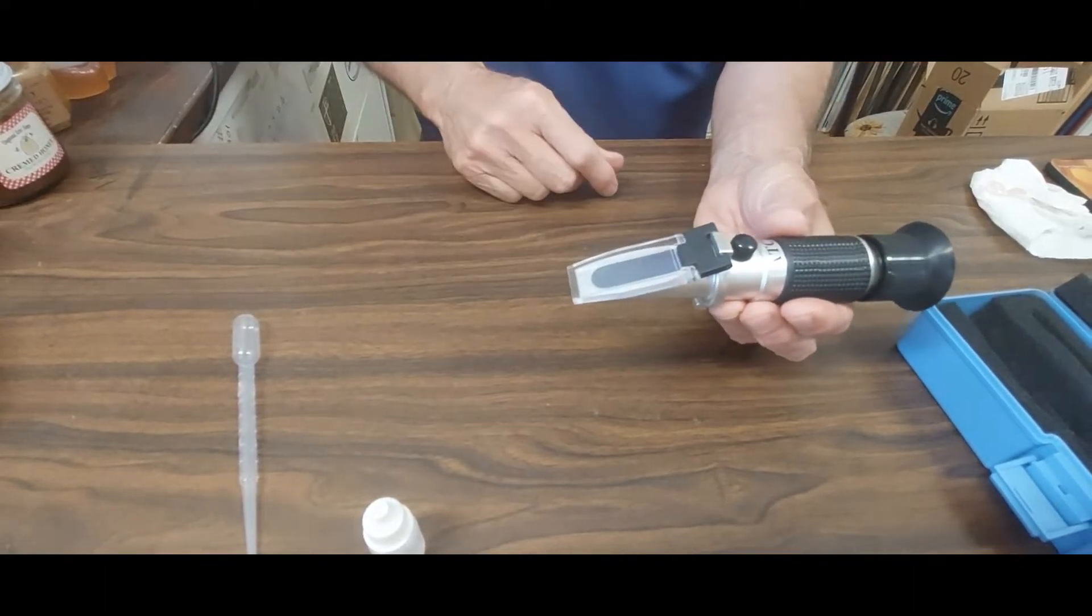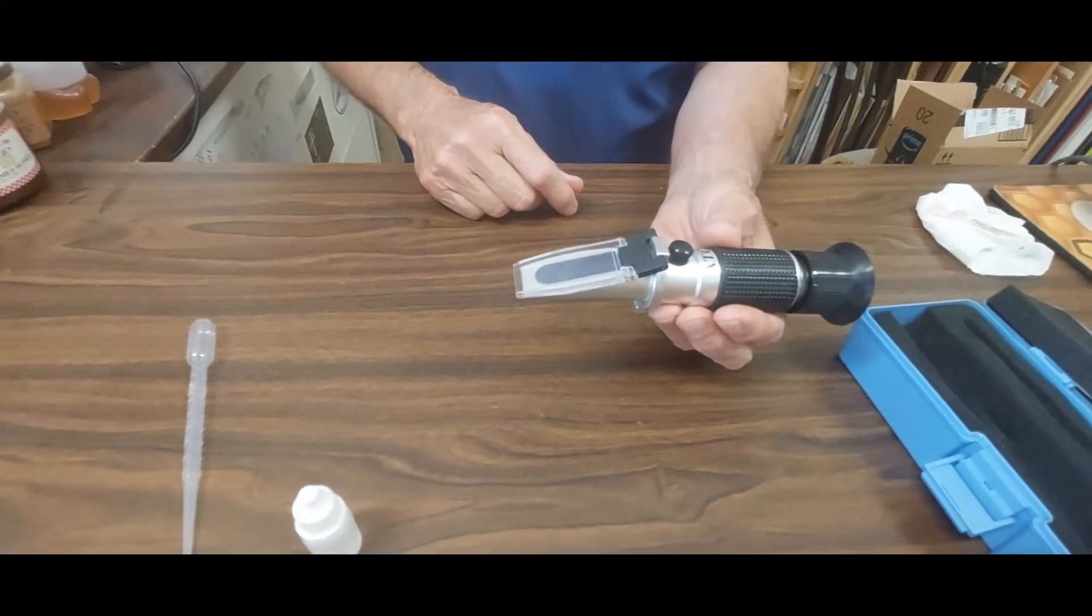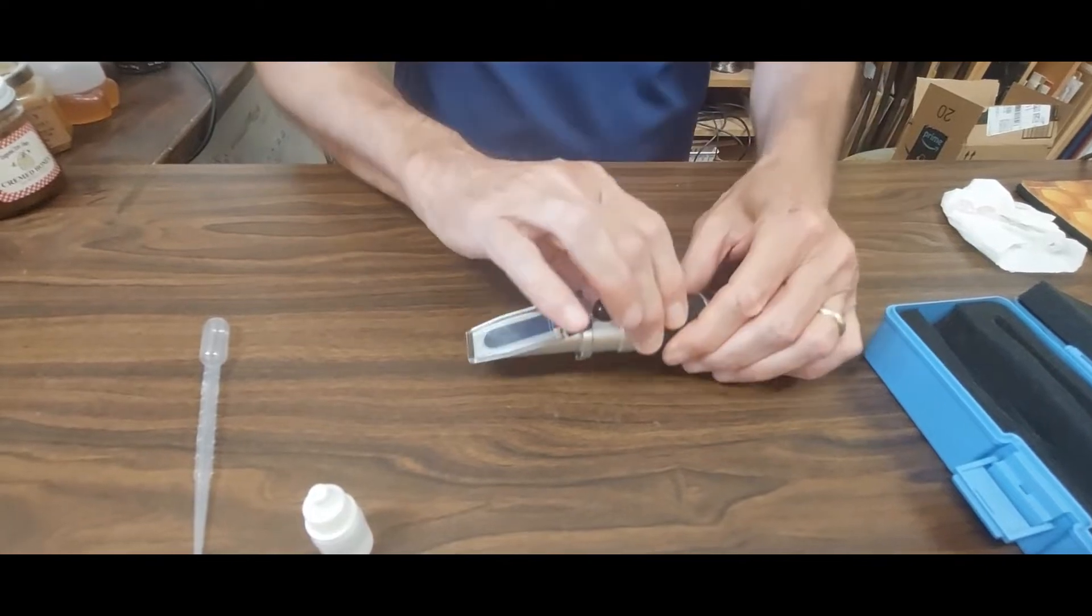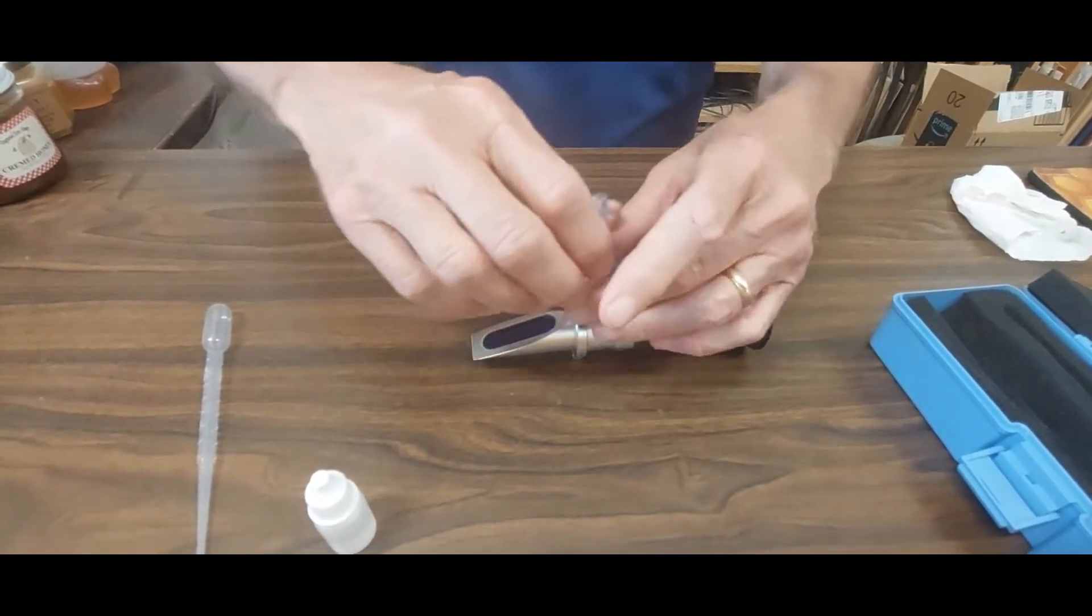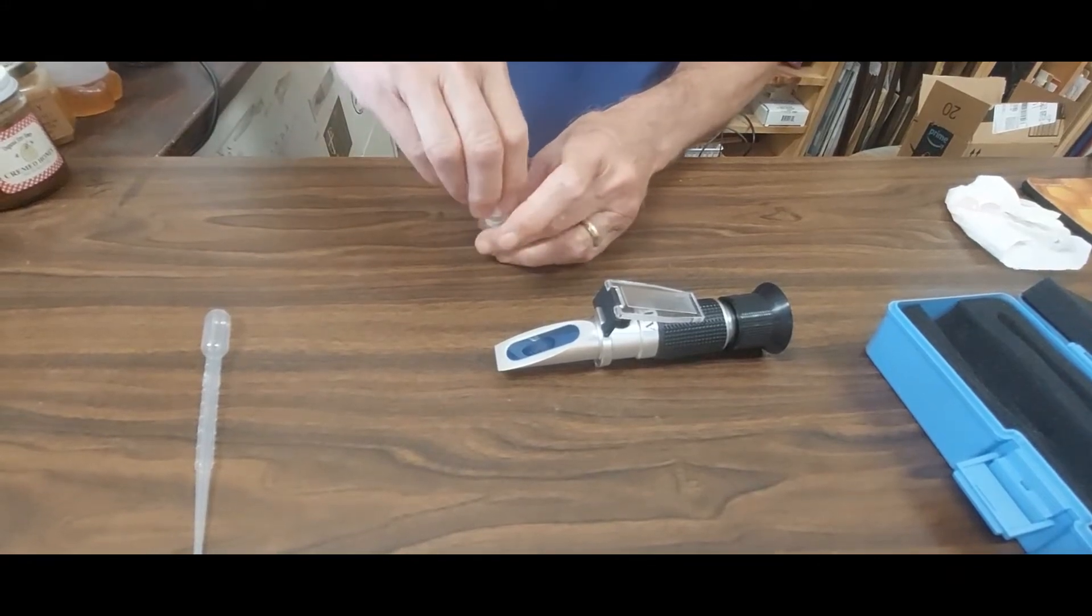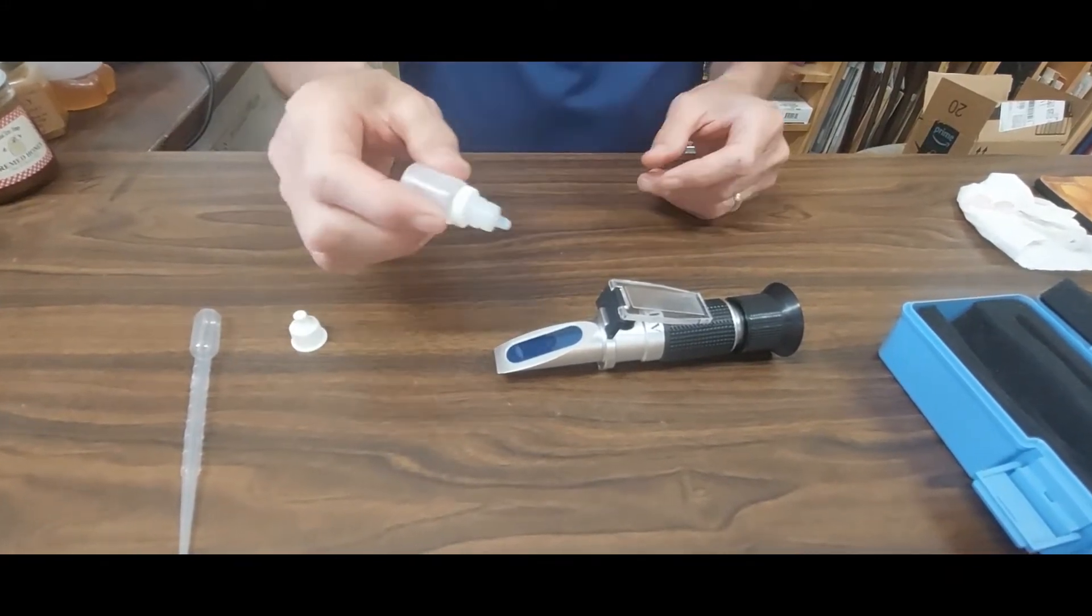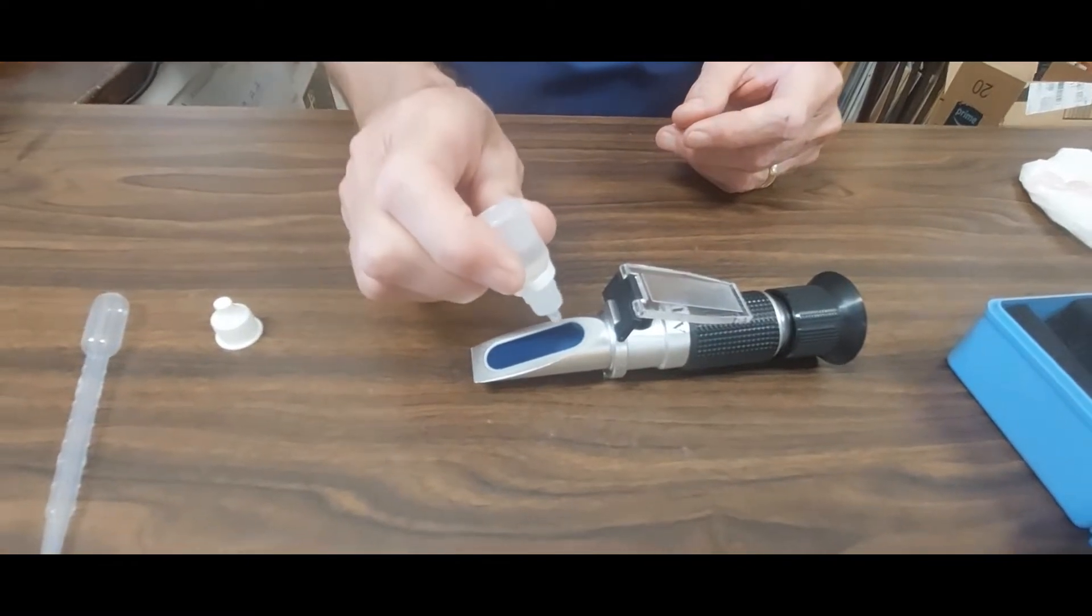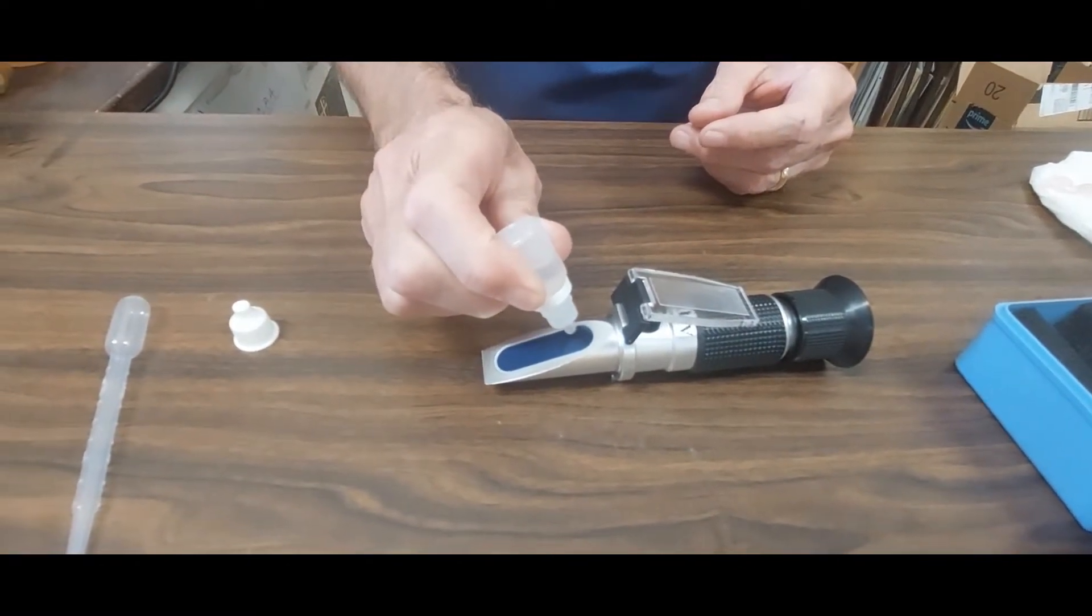Just enough to where when you close the cover it will completely fill that space. So first I want to calibrate it, so I'm going to put some calibration oil on it. So I'll set it down. I'll bring the lid back.